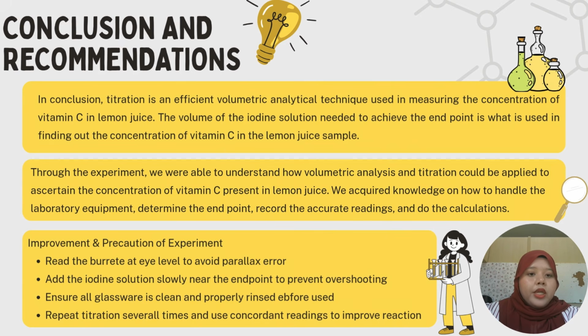So overall, this experiment enhanced our understanding of volumetric analysis and is important in determining vitamin C concentration in lemon juice.